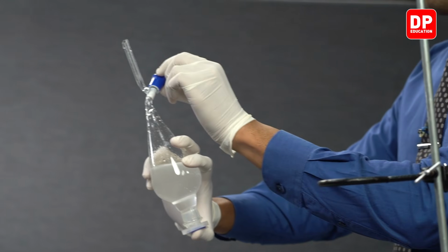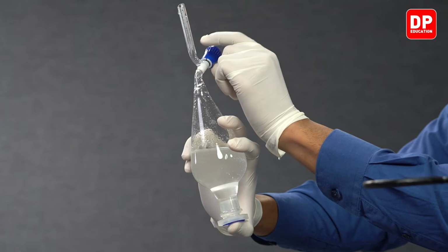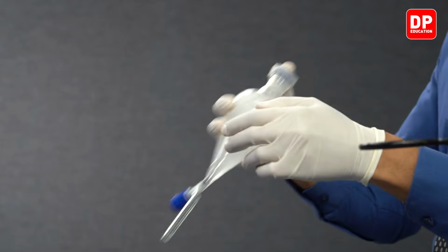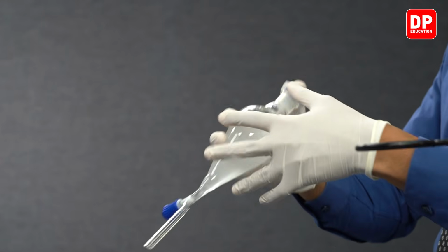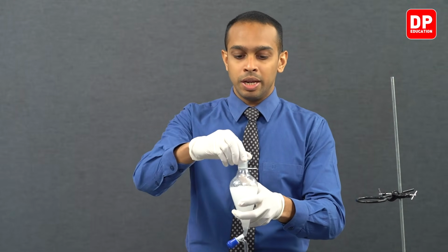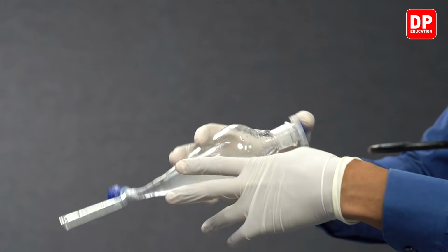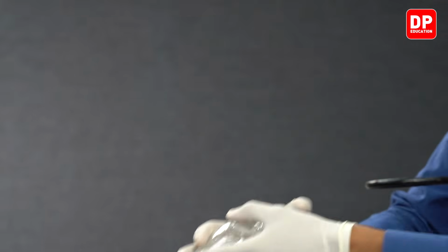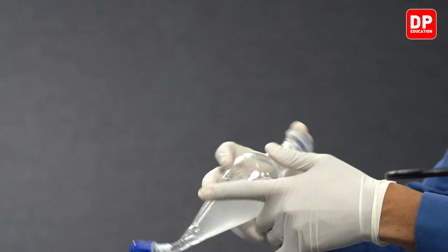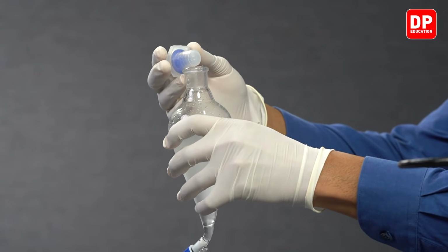So after mixing it really well, you can open this stopcock and release the pressure every time that you mix it. You can continue to shake it, and then you can relieve the pressure by opening the lid. If you prefer to keep it upside down, you can shake it and then after that open the stopcock to release the pressure. But if you prefer opening the lid instead, you can proceed to do so.